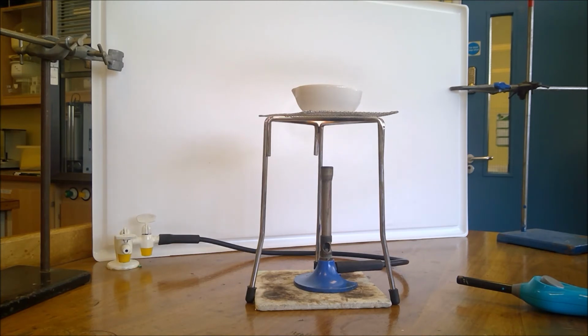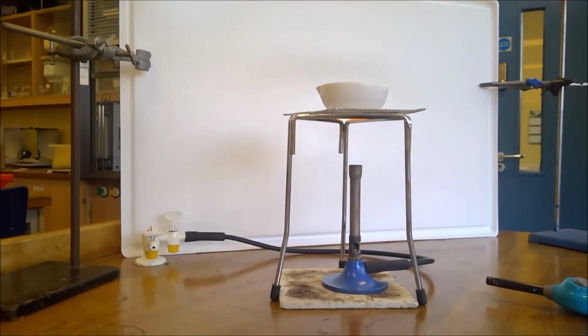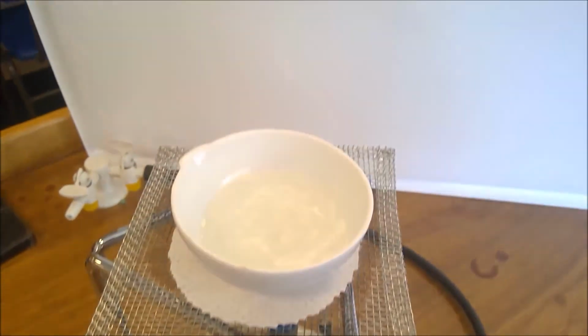At the point where we can see crystals forming, what we then need to do is stop heating and allow our solution to cool and crystallize. So hot solutions can dissolve a lot more solutes than cold solutions. So as the temperature decreases, more and more of the crystals will come out of solution there. So we can go and have a little look into what's going on here.